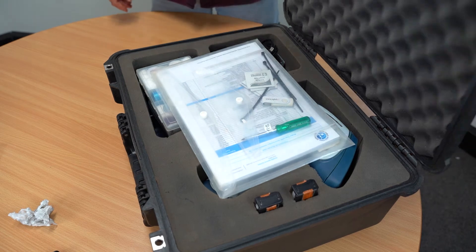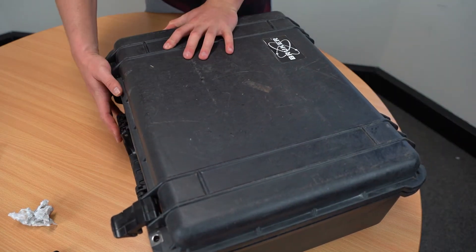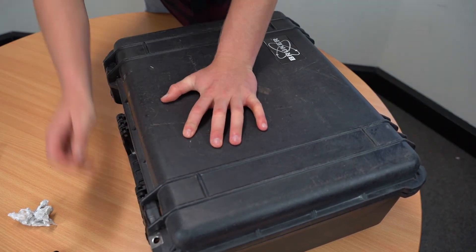If you have hired from us, the hired documents go on top and then you can close the case. And that's how to correctly pack up an XRF case.